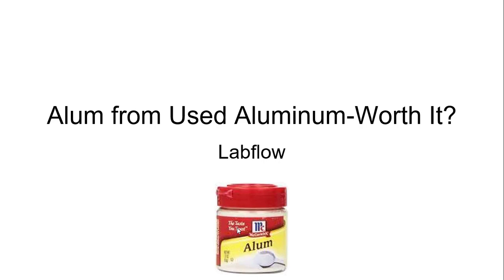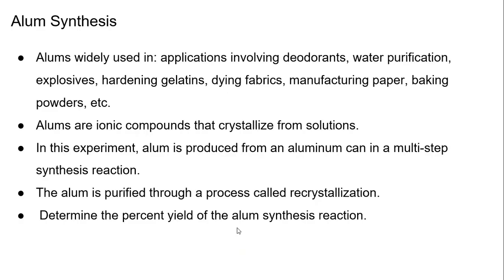So I'm going to give you the way that I do this lab in my class and not the way that LabFlow has it set up. I understand what they're trying to do, but I'm not exactly thrilled with how they presented this lab. So this lab may seem very difficult or complicated. Not the way I'm going to show you how to do it.